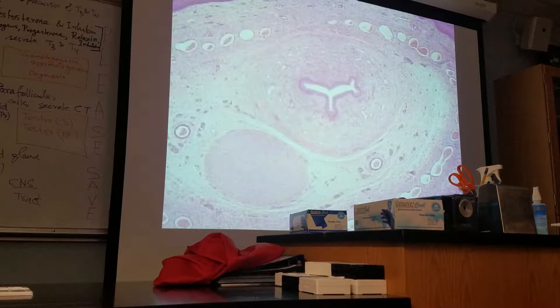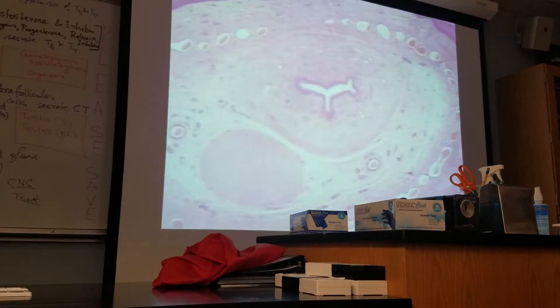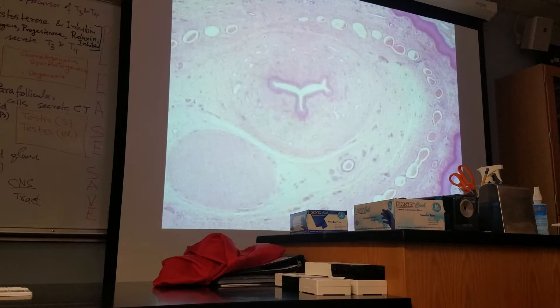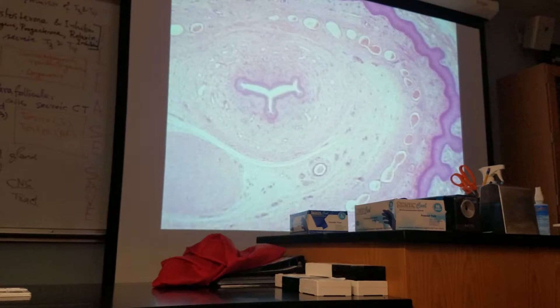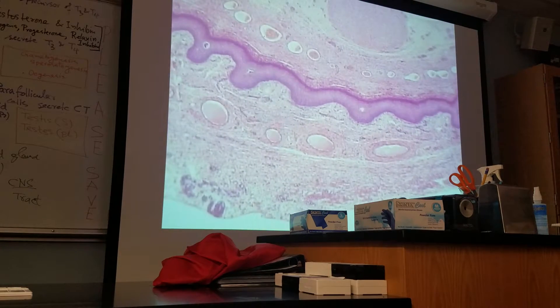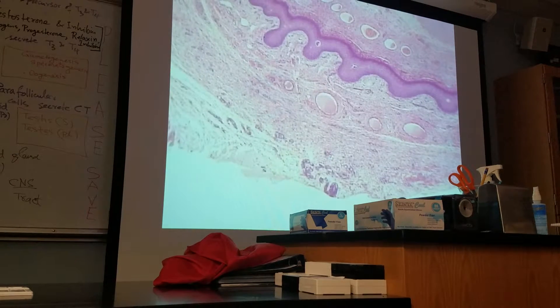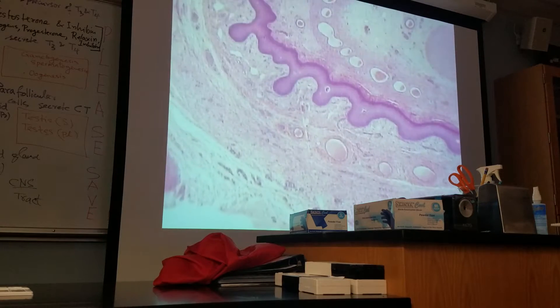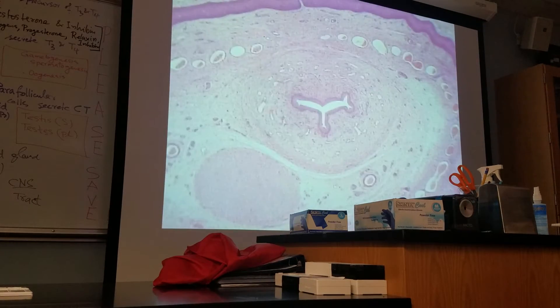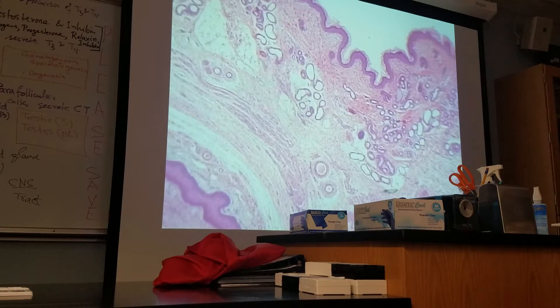This is a section through the corpus spongiosum of the penis. This portion, the whole pin position — in the center is the urethra, the spongy urethra. On the outside is corpus cavernosum; this is corpus cavernosum, this is corpus spongiosum, and again this side is corpus cavernosum.